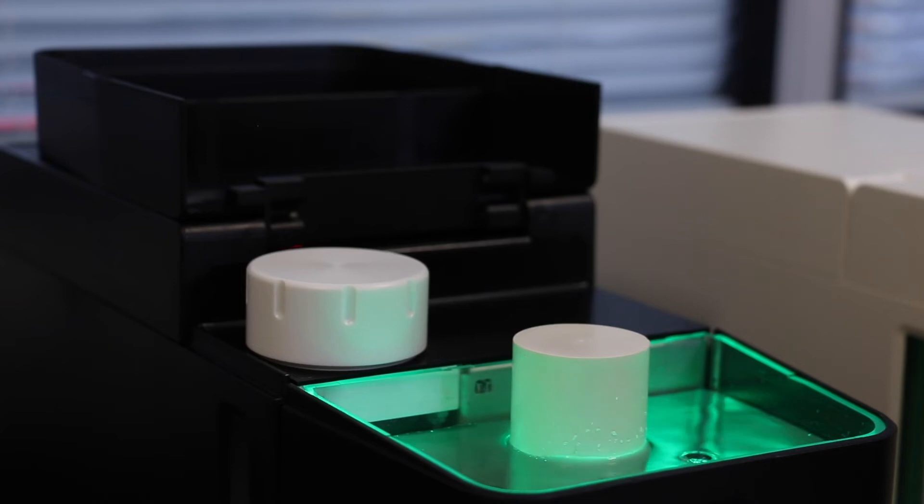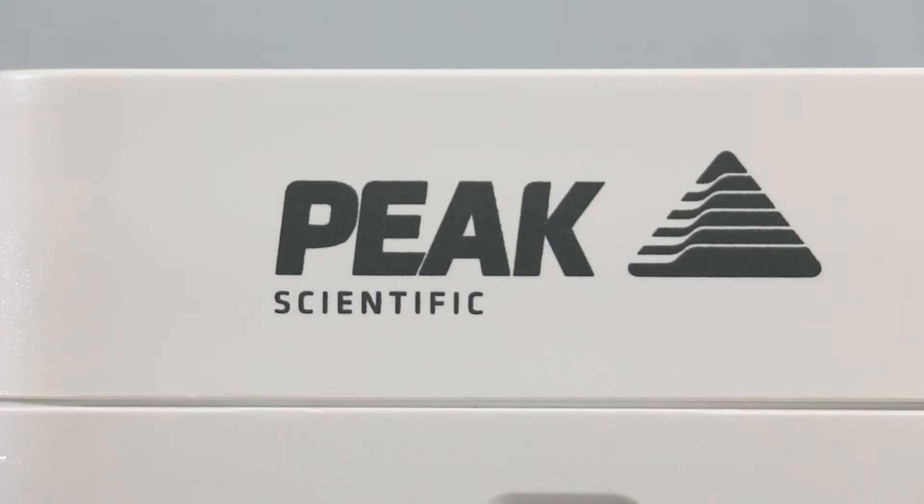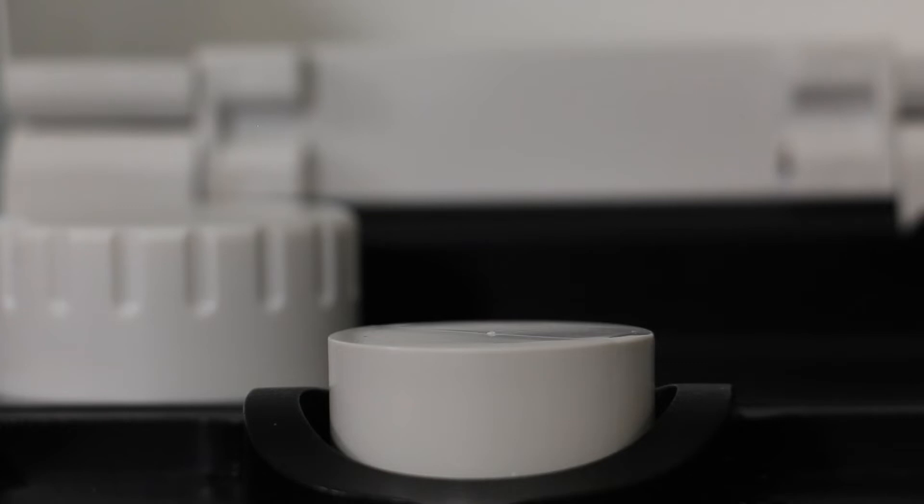Step 3: The deionizer cartridge is located in the water tank and can be accessed by opening the top panel. Step 4: The deionizer cartridge can be removed by turning the cartridge counterclockwise.